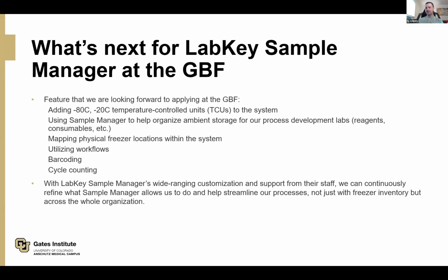And I think we can use LabKey Sample Manager to input all of the expiries and the numbers of reagents and consumables that are moving in and out of there and help them organize and understand what their consumption rates are, and better anticipate restocking needs.